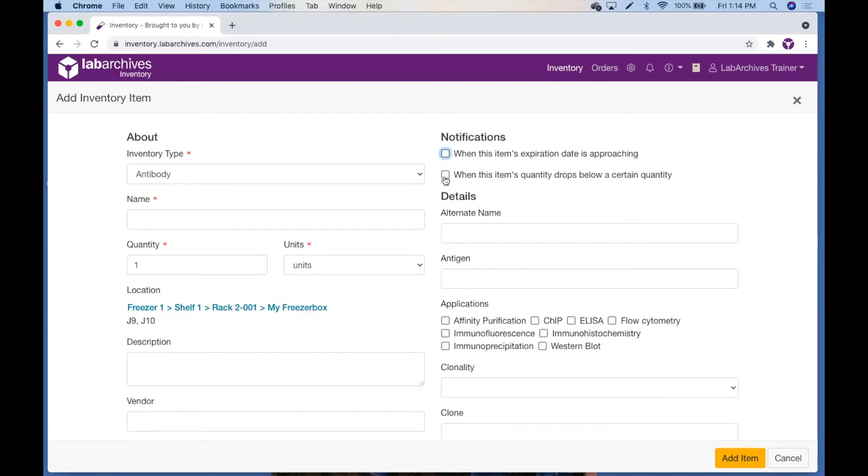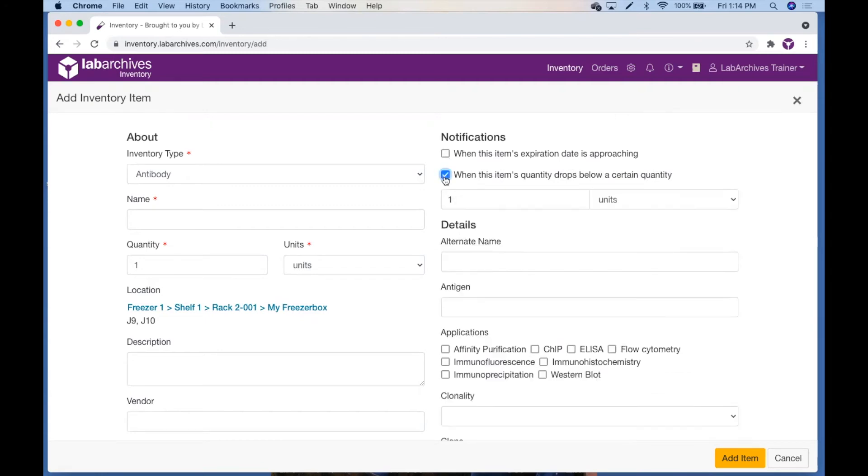When you check the checkbox when this item's quantity drops below a certain quantity, you are able to select a quantity number and unit of measurement.